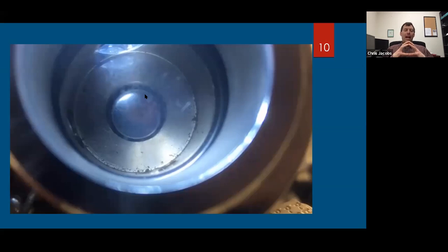And like I said, it takes some time to get used to doing this so you can see what you're looking at. Now, the other thing about this video I'm going to show you, I did not monitor the temperature. I was just shooting this video so you could see what the condensation droplets look like on this internal mirror. So you'll not hear me looking at the temperature. I just have my camera pointed directly inside the chamber so you can see it. But you're going to be focusing right about in this area. You'll start to see it start in the center, and then after a second or two, it'll start to move out. And then as it condenses down, you'll see it shrink back in again.